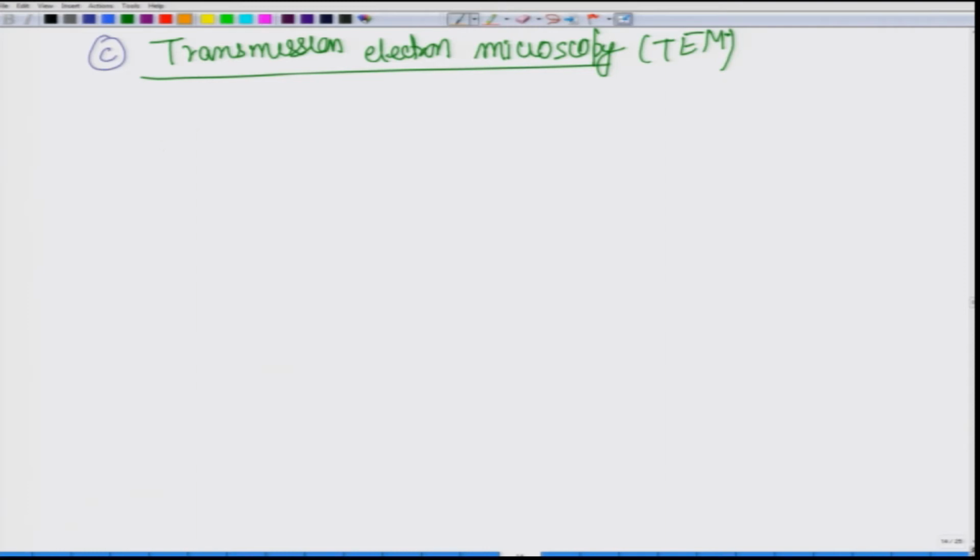So, for example, let us say there are certain planes like this, and this is your half plane. The dislocation line is somewhere over here, and your beam is coming like this. The beam is coming in and getting diffracted, and some of the beam which falls like this will get diffracted in a different direction because of what is called the diffraction vector.